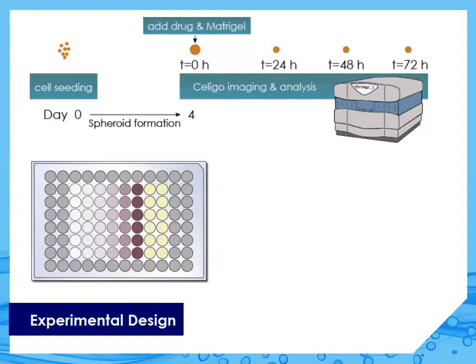Automated image acquisition and quantification was carried out throughout the entire experiment. Imaging was done before and right after Matrigel embedding, which we considered time point 0 of the experiment. It was then imaged again at 24 hours, 48 hours, and 72 hours after start of the drug treatment.